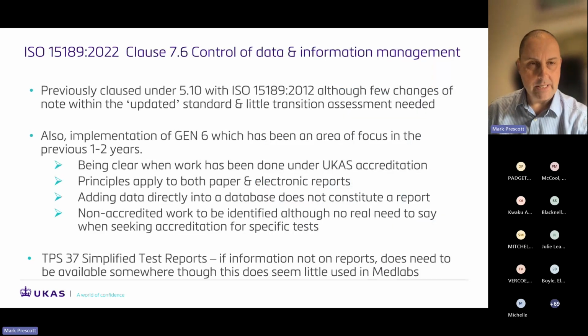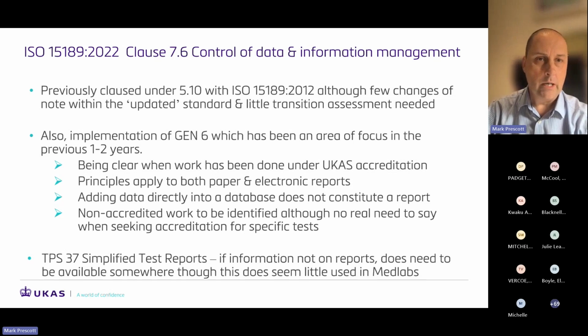So we're talking about the transition today. As far as information management goes, nothing has actually changed with the move to 2022. The clause has changed. It now sits under clause 7.6, and the wording has been slightly changed. I think it just talked about information management before. It used to sit right at the very back of the 2012 standard, so it's just been moved forward. But really, all the areas of this are pretty much rated as minor in the gap analysis document that everyone's doing. So really, not a lot of transition assessment is needed as regards the LIMS systems.